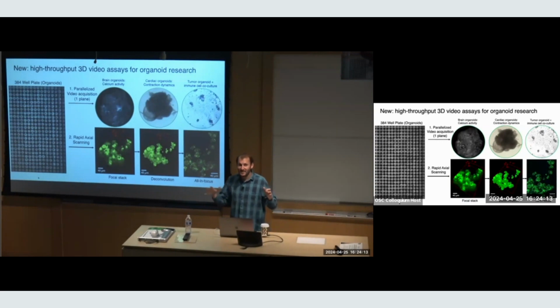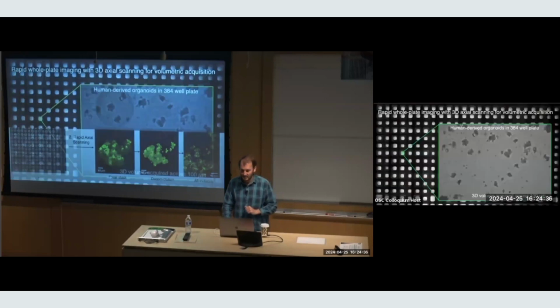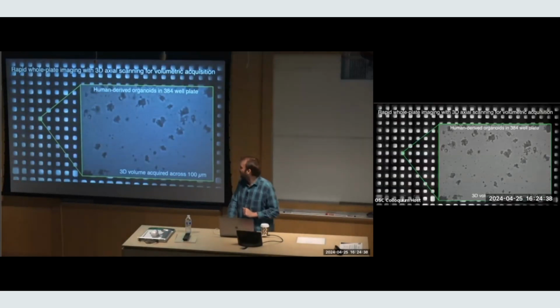I know the title of my talk was 3D imaging, so I had to explain. We also are doing it, but we're doing it very simply. We're just doing a focal stack for this system where we're zoomed in. We haven't done anything fancy yet. You can imagine there's lots of fun things to do that we're thinking about, but we've just been doing focal stacks. And so, yeah, you can do just the standard wide field focal stack capture in this setup as well. So we kind of capture data like this. These are human-derived organoids, and then we can begin to process it.